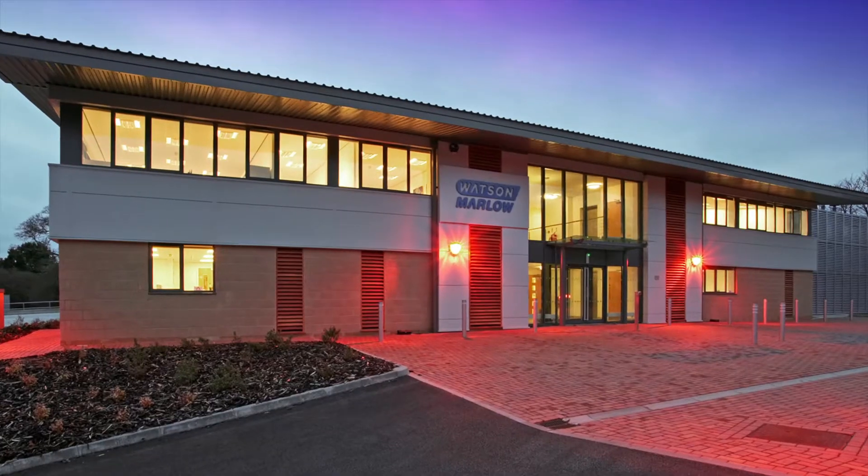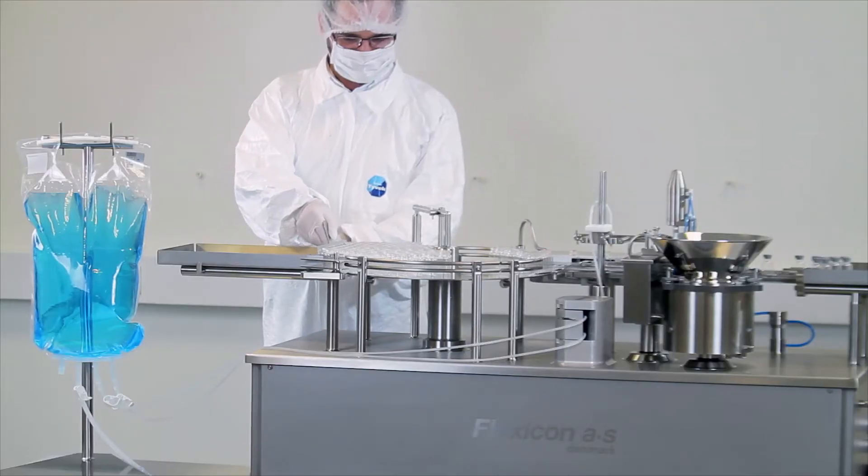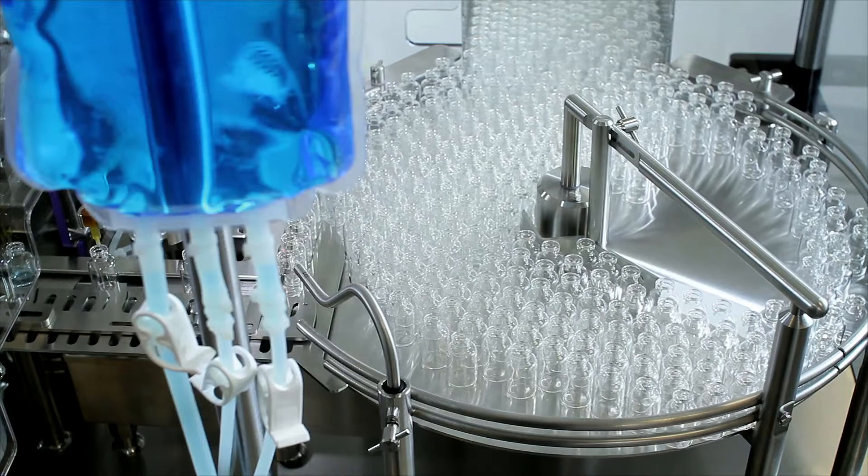Manufactured in our new cleanroom facility in the UK, we can easily respond to changing production demands, helping you manage your filling and capping lines.